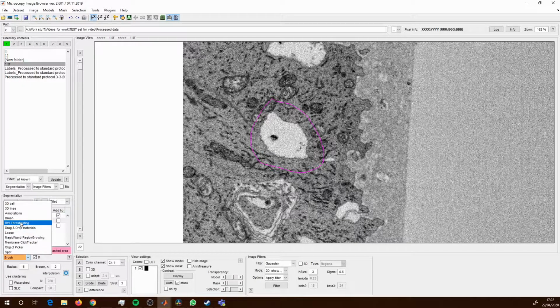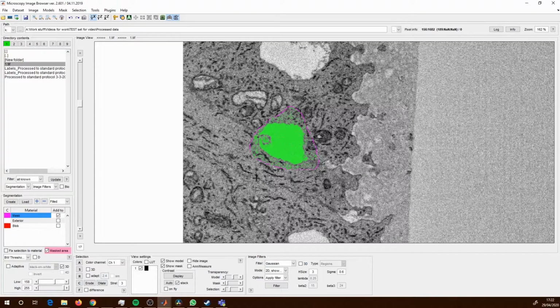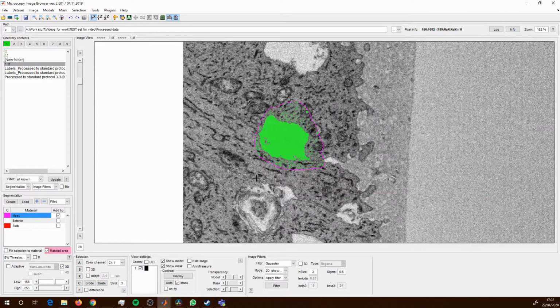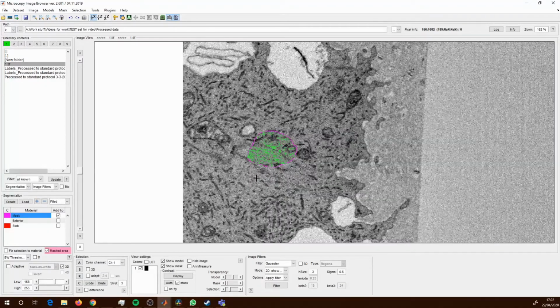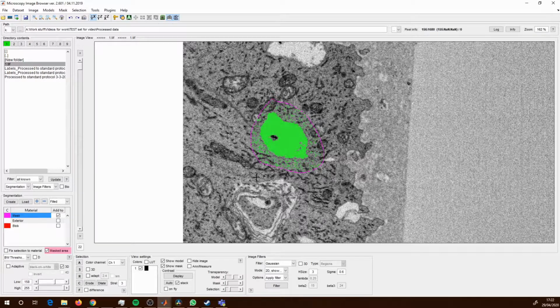If I then return to the black and white thresholding tool, the threshold I used previously for the other object should work for this one because it's the same kind of object. So if I click on the white text box and hit enter, now you can probably get away with doing 3D straight away for this. If you notice, that was quite quick because it's just this smaller area. We still have a lot of erroneous segmentation around the outside, however.